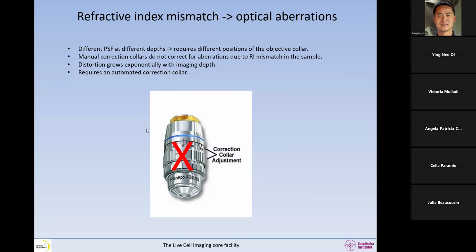And again, it depends on your scientific question. It's not a problem all the time. The more stringent your scientific question is, the more careful you have to be with your sample preparation. If you are trying to detect and measure small differences, for example between your mutant and your wild type, you have to be super careful with your sample preparation.